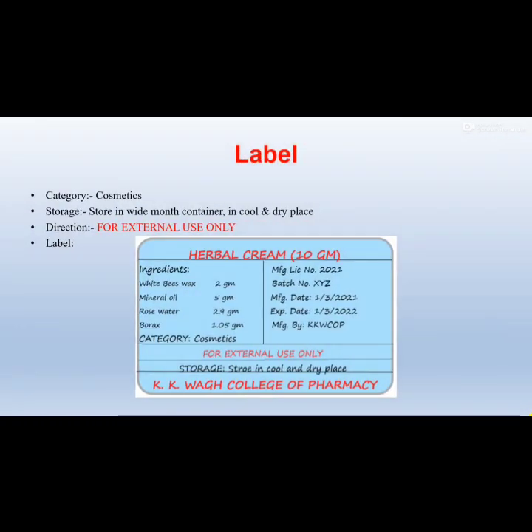So the label for herbal cream. The category is cosmetic. Storage conditions are mentioned, that is, a wide mouth container is required, and it should be stored in a cool and dry place. So the direction for this formulation, it is only used for external use, and this is the label.